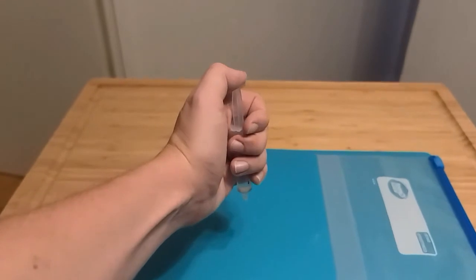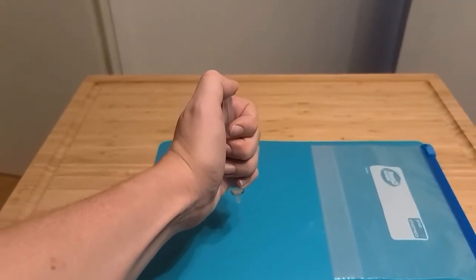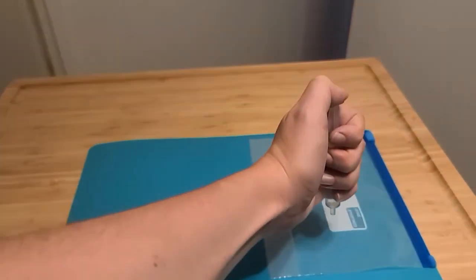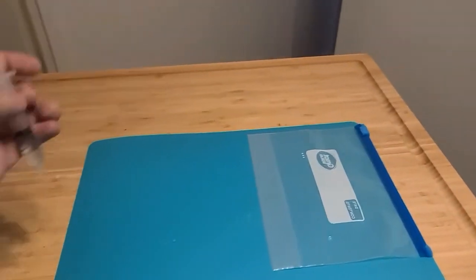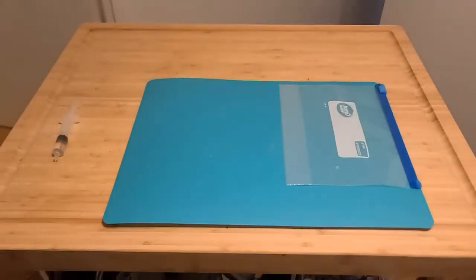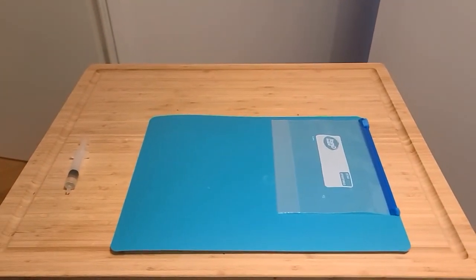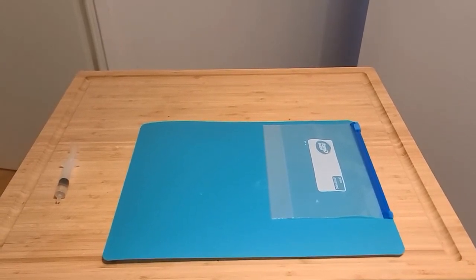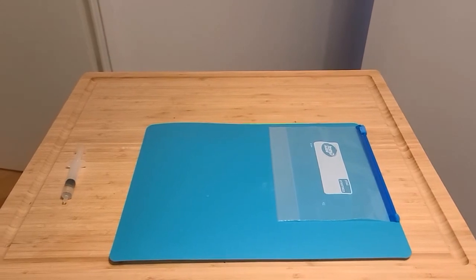To start, I'm going to drop a single drop onto the surface of the cutting board and a single drop onto the surface of the Ziploc bag. Then I'm going to make contact angle measurements and plot them, seeing if there is a difference between high density and low density polyethylene in terms of wettability.